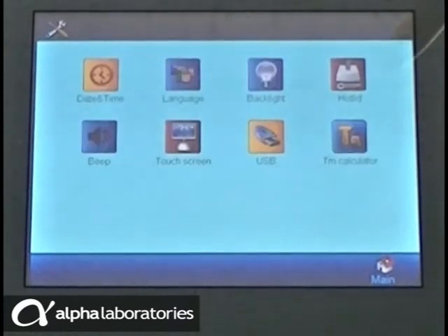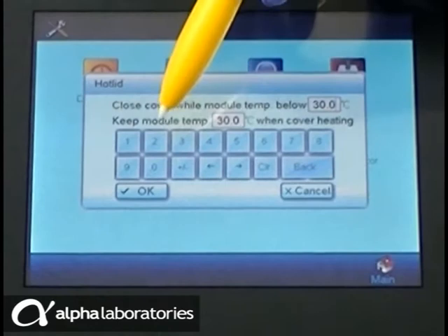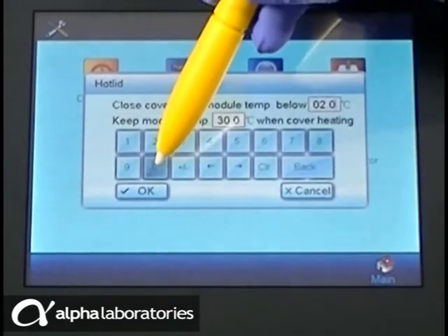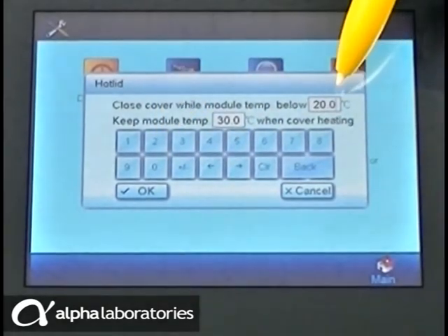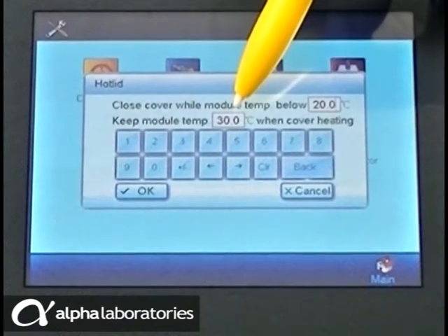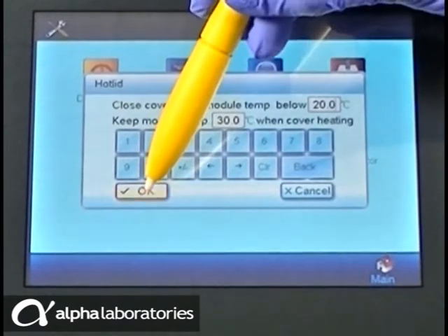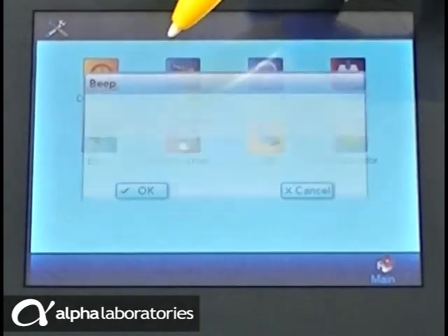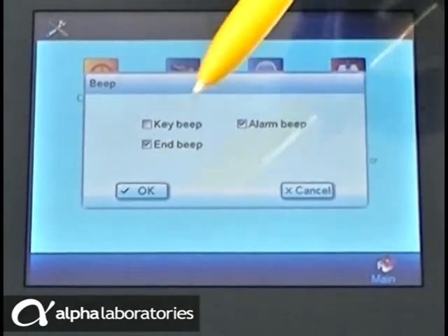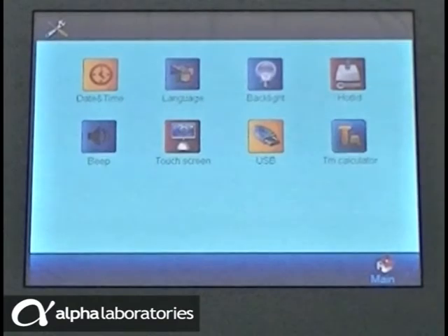The hot lid controls can be modified here. This number defines the temperature of the block below which the hot lid is switched off. The second temperature is that maintained at the start of a run before the hot lid gets to its target temperature. The audible notification beep can be switched on or off for different conditions as preferred.